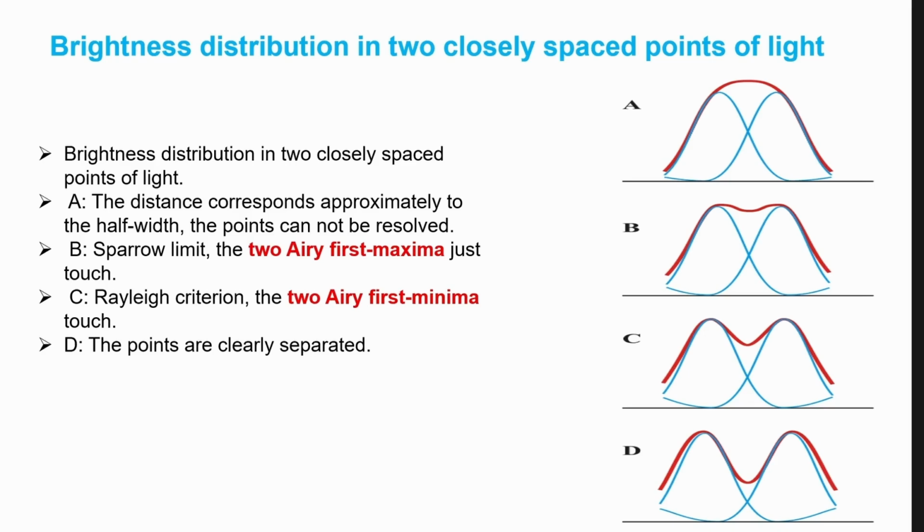And this means that the point spread function should be smaller, should be thinner. And you remember in one of the slides we discussed how the point spread function, that is basically the shape of the Airy pattern, will change if I increase the numerical aperture of the lens. You remember it was 0.2 all the way to 1.3. The size of the point spread function very dramatically decreased. So with higher NA, you have higher resolution, a smaller point spread function.